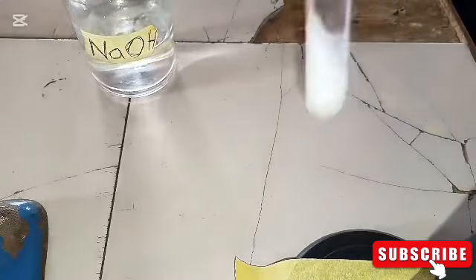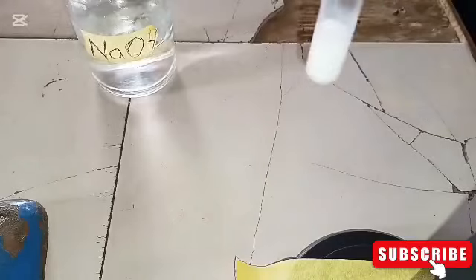You can see that putting drops of sodium hydroxide led to the formation of a white precipitate that was insoluble in drops of sodium hydroxide. You can see the white precipitate forming gradually, and then after about 2 more drops we could get the white precipitate in good amounts.